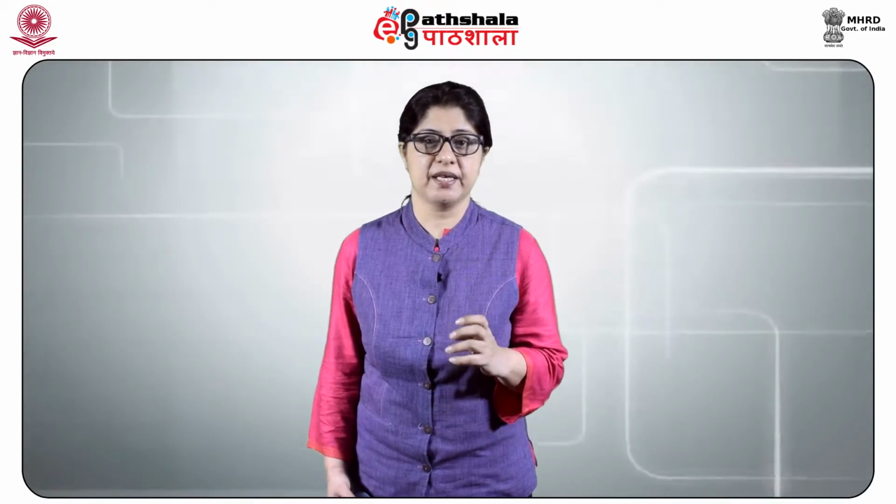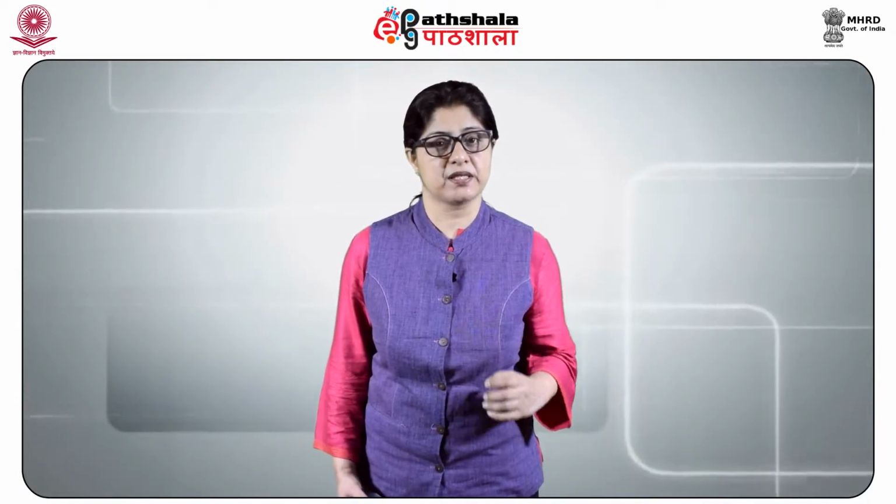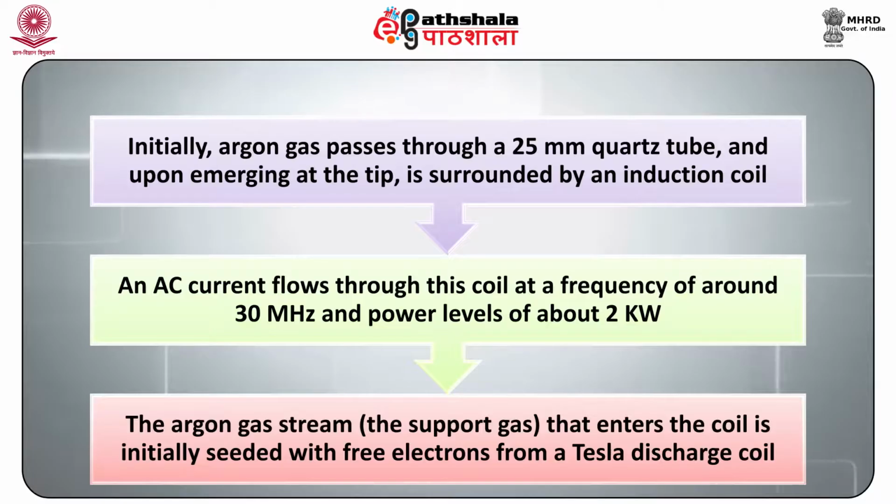The inductively coupled argon plasma, ICAP or ICP, torch is a special type of plasma that derives its sustaining power by induction from a high frequency magnetic field. Initially, argon gas passes through a 25 mm quartz tube and upon emerging at the tip is surrounded by an induction coil. An AC current flows through this coil at a frequency of about 30 MHz and power levels of about 2 kilowatts.